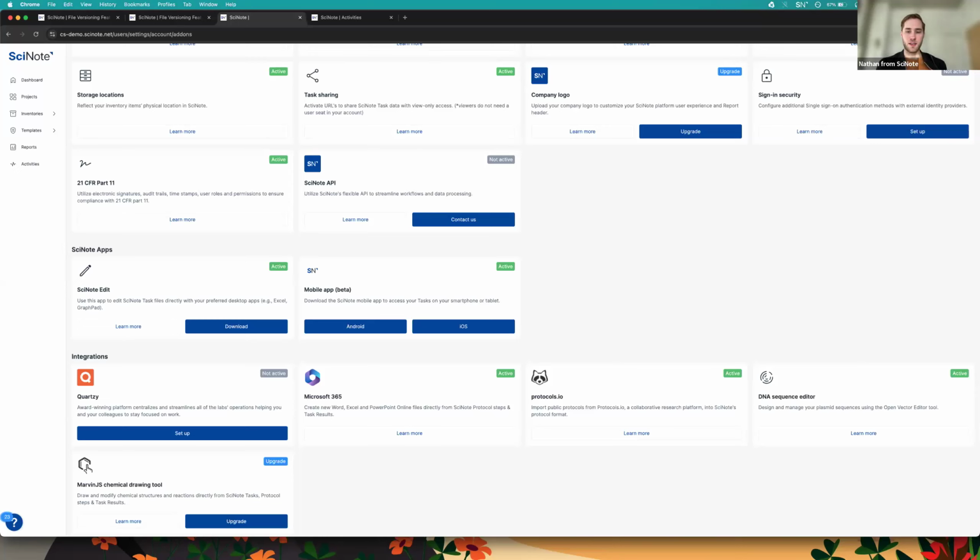If you are, let's say, editing a file that's stored on a protocol template, and then you're setting those protocol templates and assigning them to tasks, linking them to tasks over time, whatever version of the file that's on the task that's copied or duplicated over time is the version that will be maintained in that new protocol.